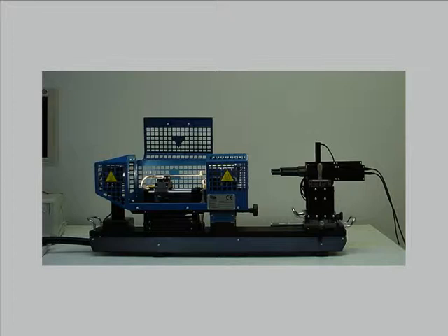The high innovative design is based on two microscope optics with high magnification which are framing both ends of the sample.